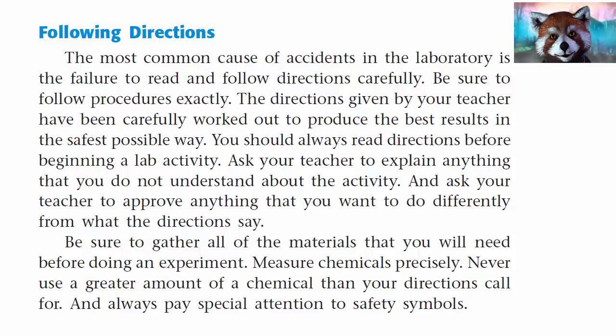Be sure to gather all the materials that you will need before doing an experiment. Measure chemicals precisely. Never use a greater amount of a chemical than your directions call for. And always pay special attention to safety symbols.